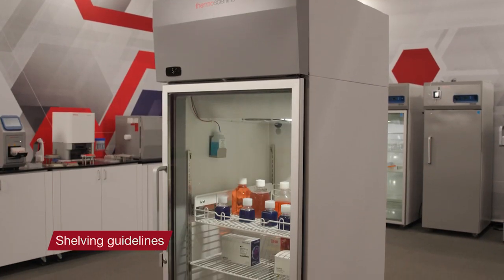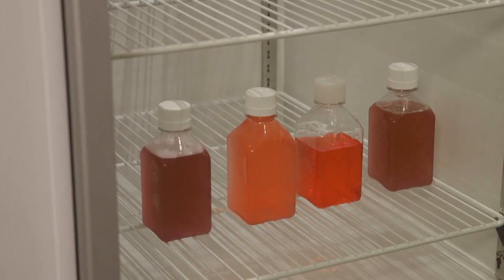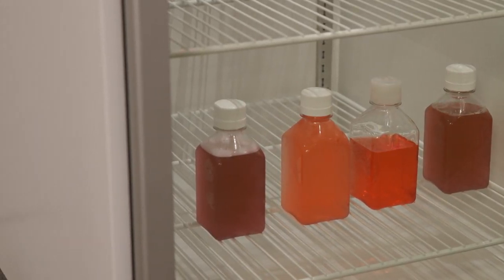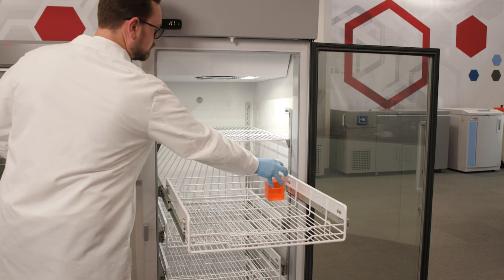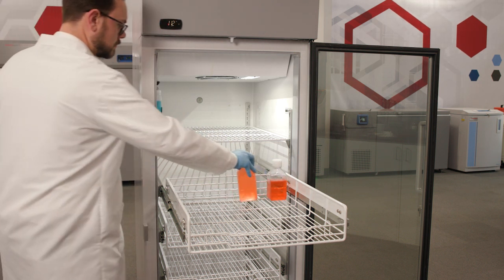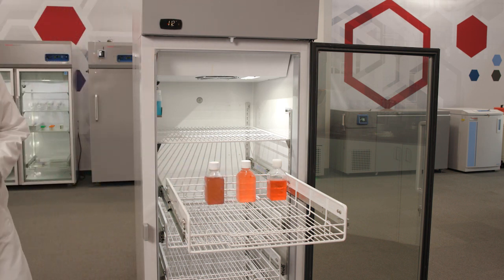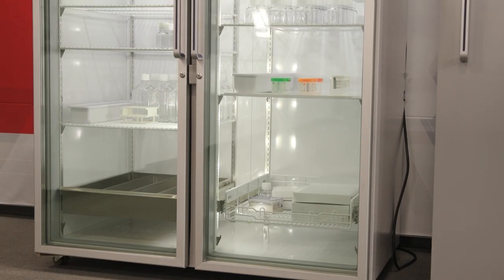Observe the following guidelines for safe use of shelves and baskets. Place no more than 100 pounds on a single shelf. Baskets in 12, 23, and 50 cubic foot capacity pharmacy refrigerators can safely hold up to 60 pounds each. The baskets in 30 cubic foot capacity models can hold up to 80 pounds.